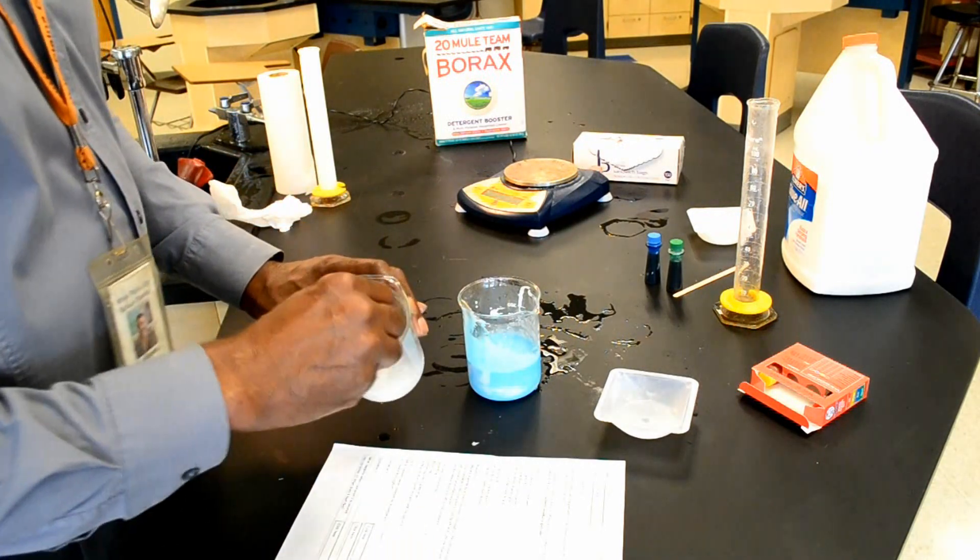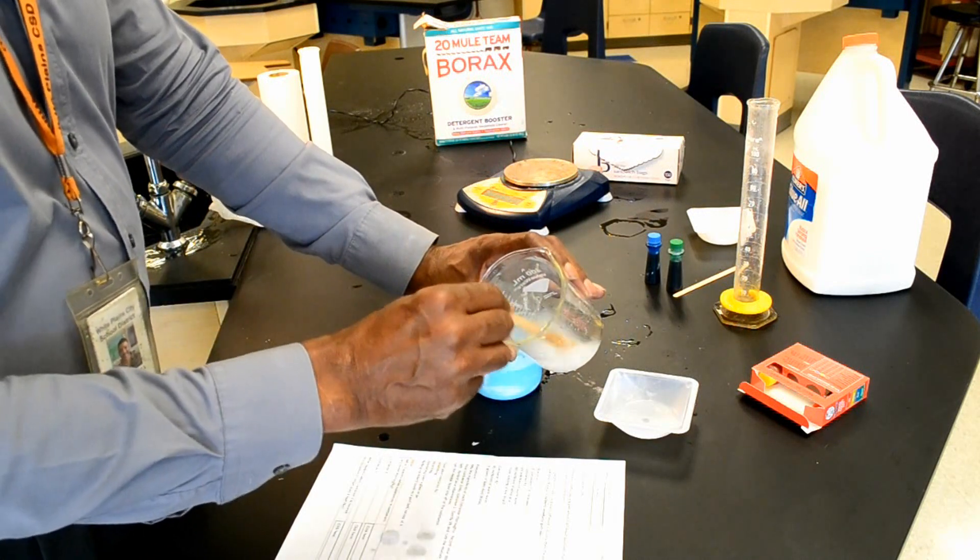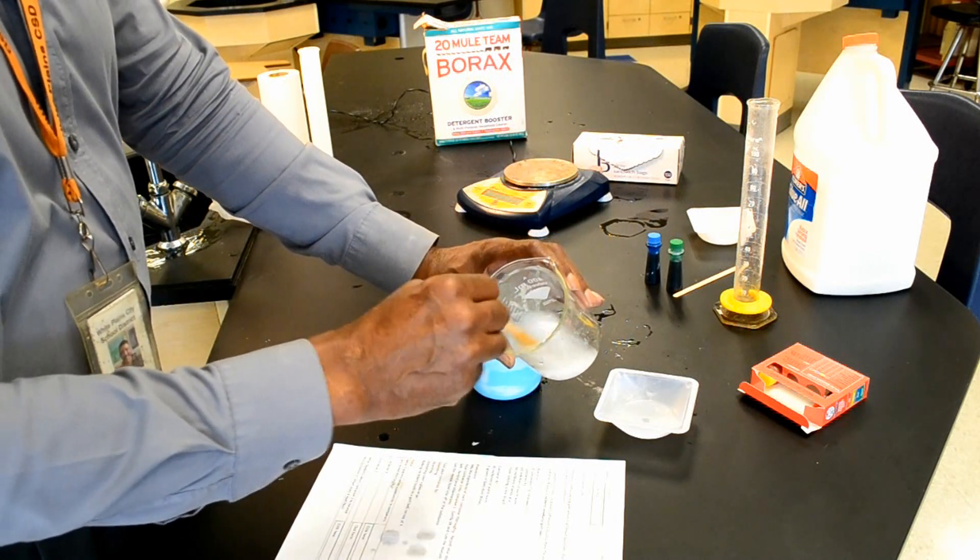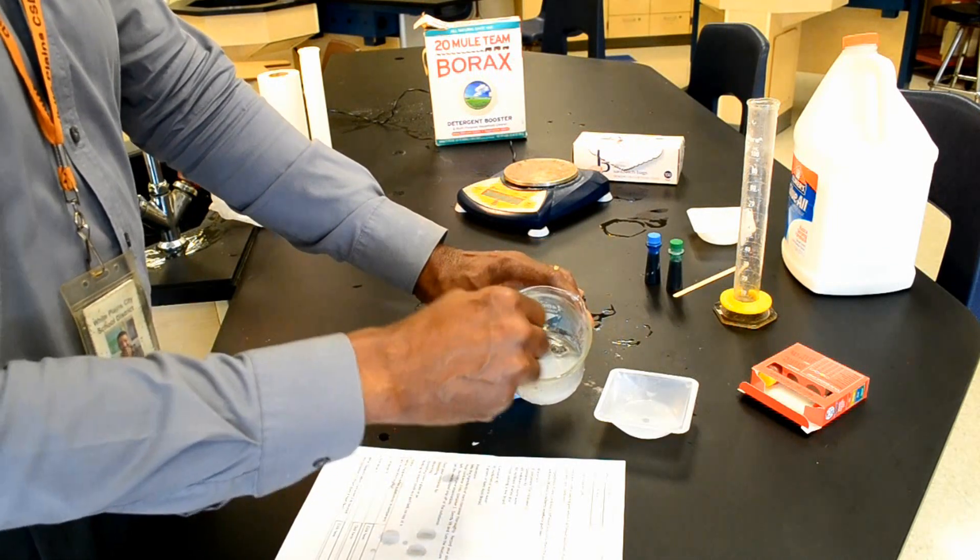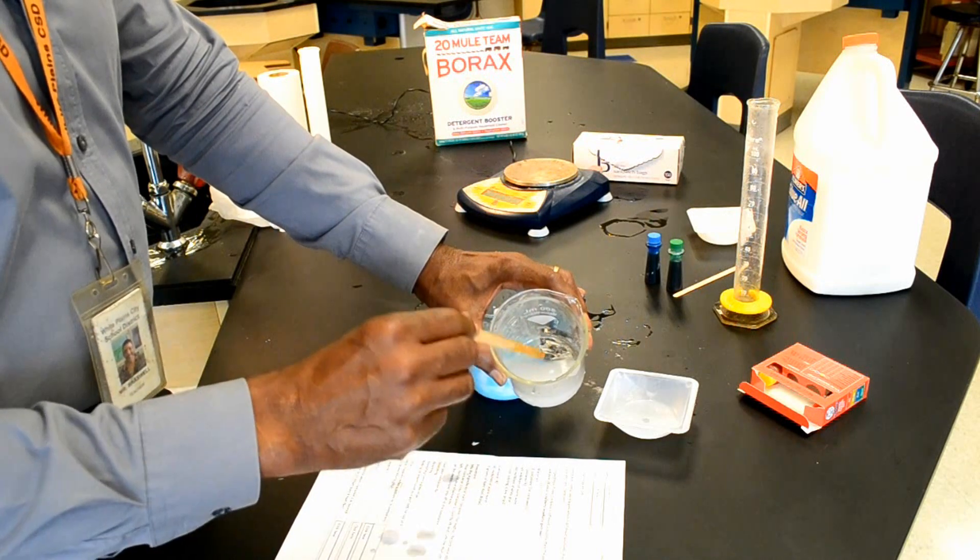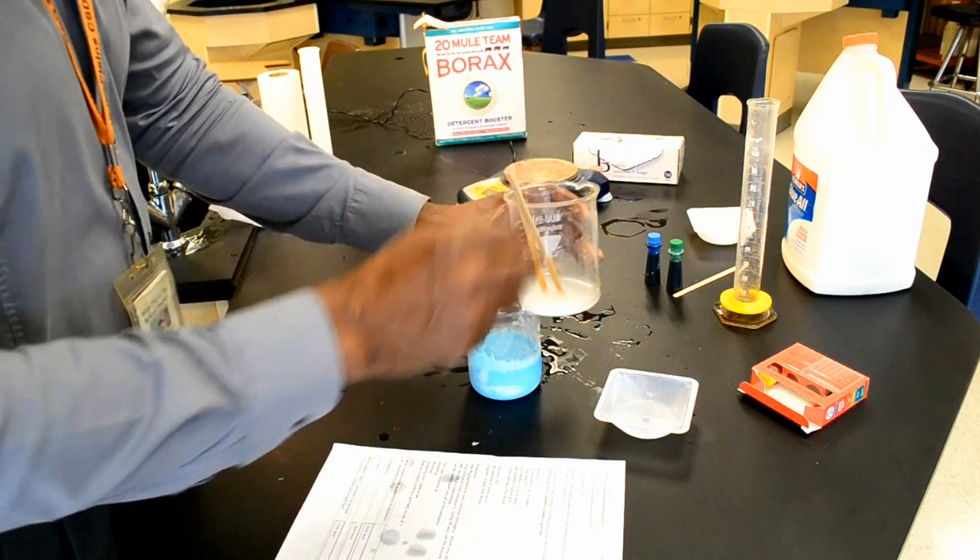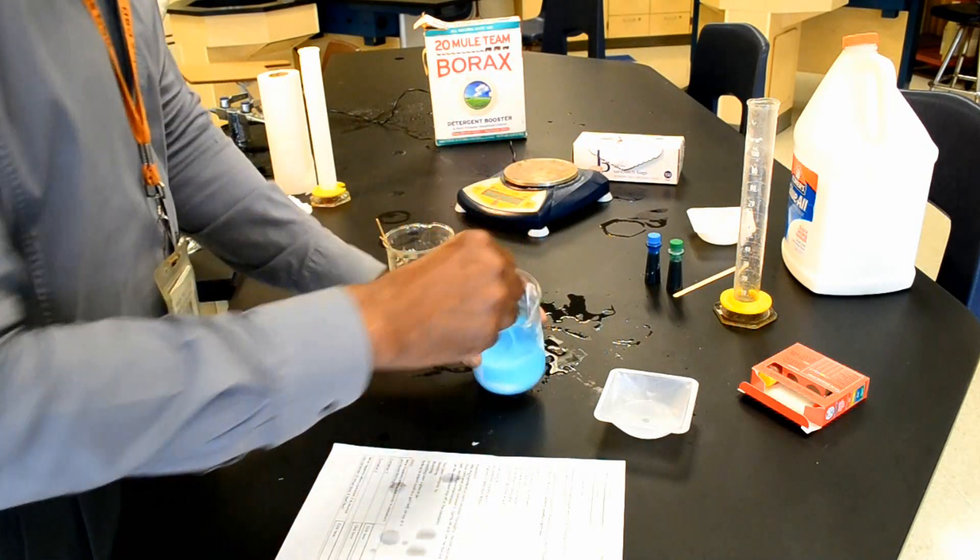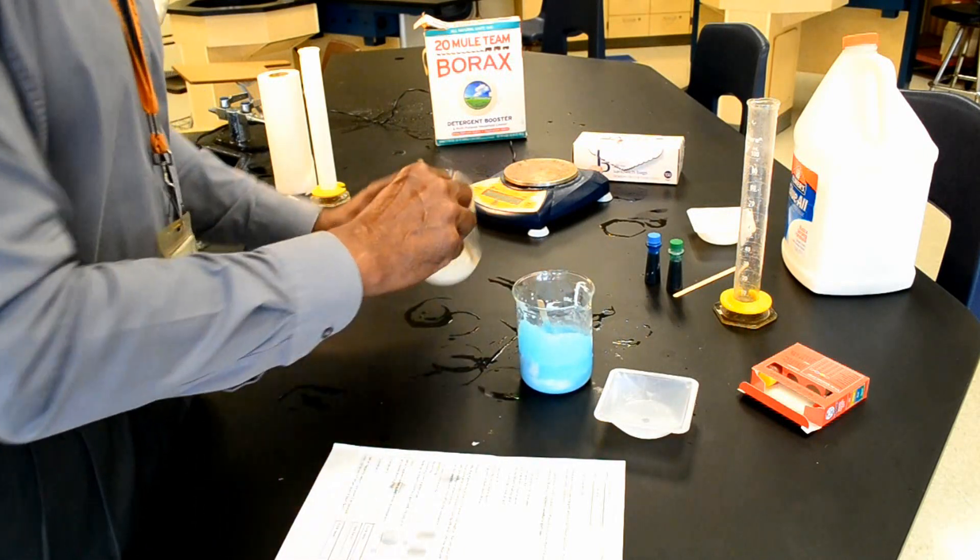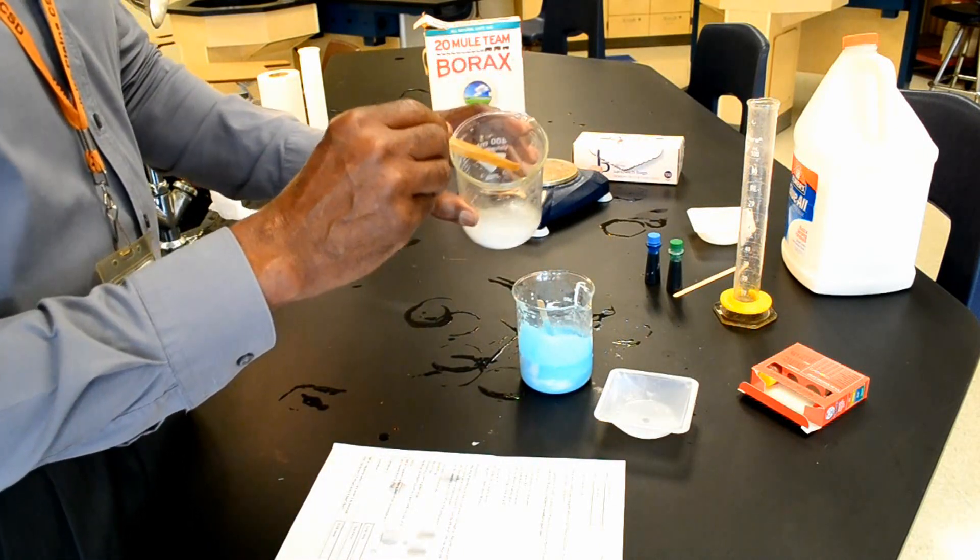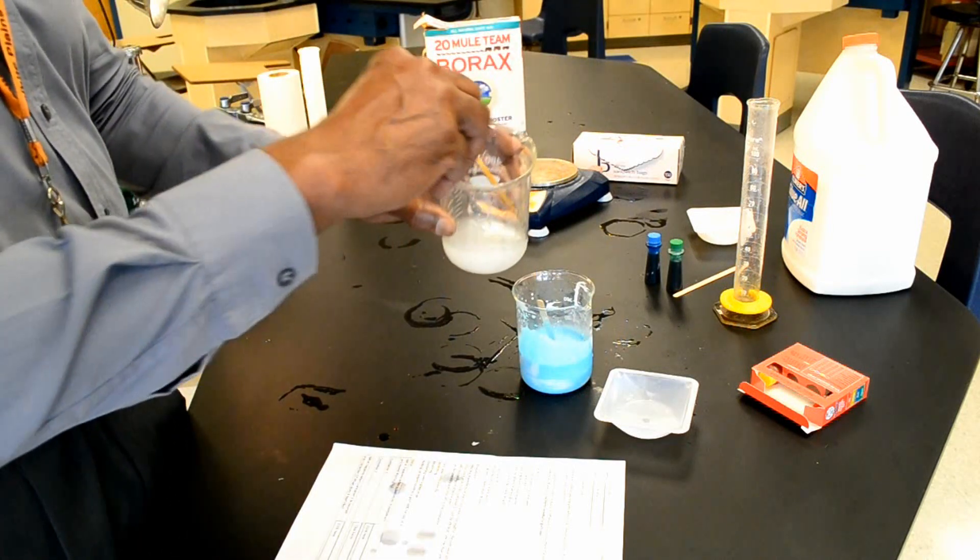I'm going to mix it together, but you can see that the sodium borate actually settles out of the solution a little bit. This is called a heterogeneous mixture, which means that you can actually see some of the individual parts of the mixture. In a homogeneous mixture, it looks very uniform. In a heterogeneous mixture, you can actually see the different parts of the mixture.